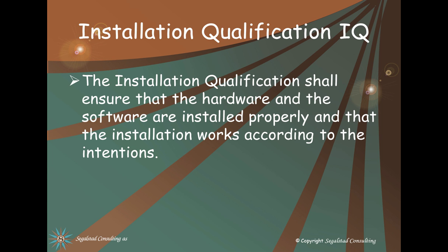We generally have a sandbox database where we play around trying to find out how to do things, and this is not under any type of control. The implementation or validation instance, where we implement the system, this needs to be under control. We also use this for validating the system itself and the implemented and configured data. When the configured data has been validated, we can move this to the live instance so that it can be used. Then we have the live database instance.